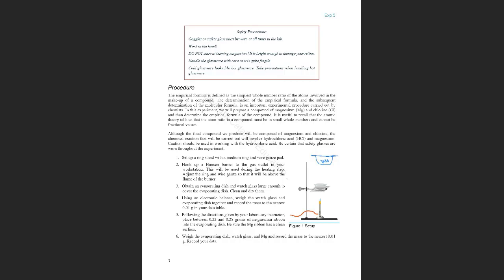So the reaction is very, very simple. First of all, you are going to take the weight of just the empty evaporating dish and the watch glass.